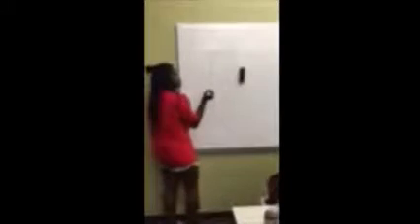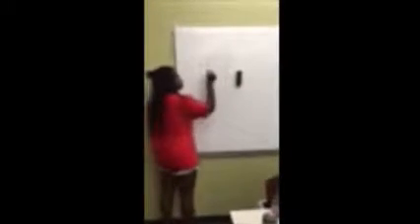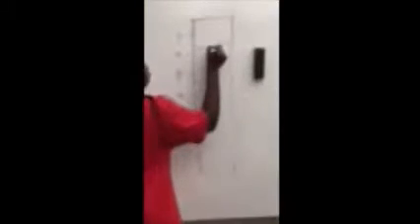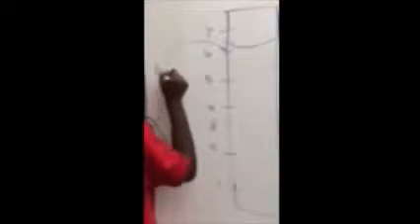In order to read the meniscus of a pipette, one must hold the pipette at eye level and locate the amount of substance by finding the lowest point on the curve of the top of the substance. After finding this point, one must estimate the ghost decimal, which in this case is to the 100th place.